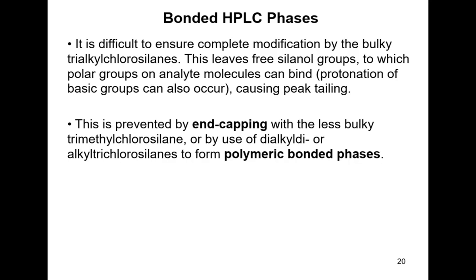There is an issue though, because these chlorosilane reagents are quite large molecules, quite bulky, and the OH groups on the silica are quite closely packed together. So you don't necessarily get complete coverage of the silica with these reagents. So you end up with, I'll just try and roughly illustrate this.